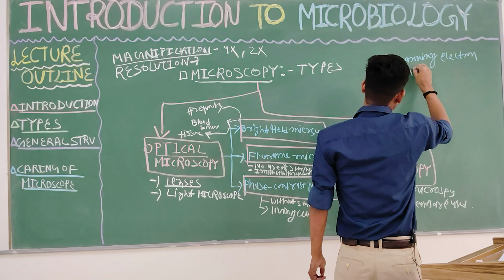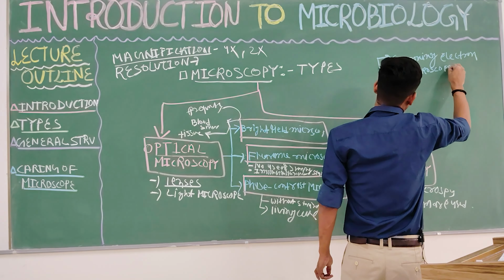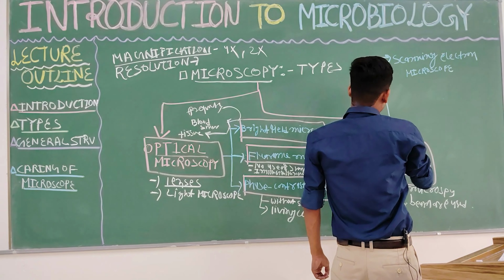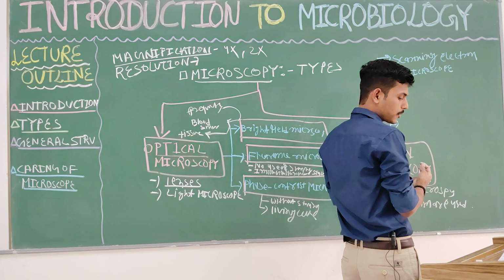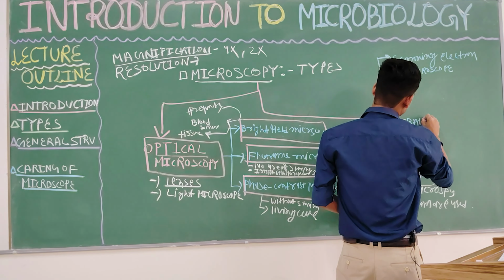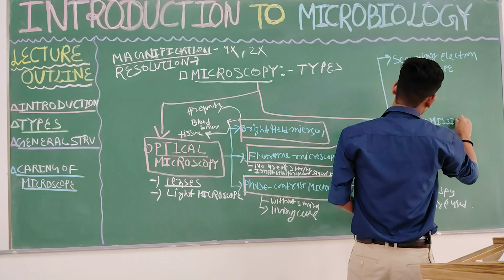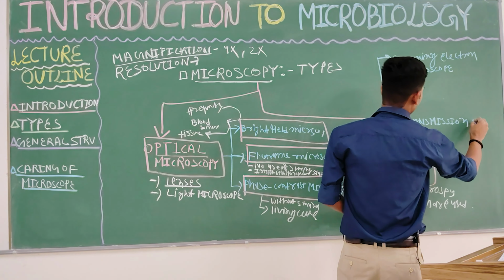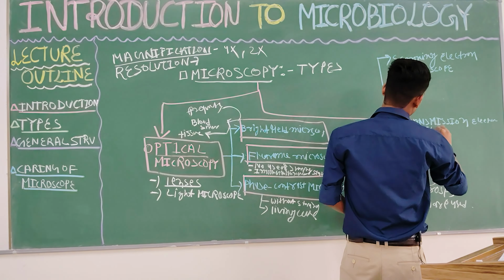And another one is called the transmission electron microscope.